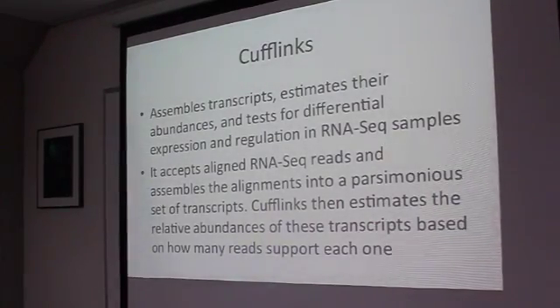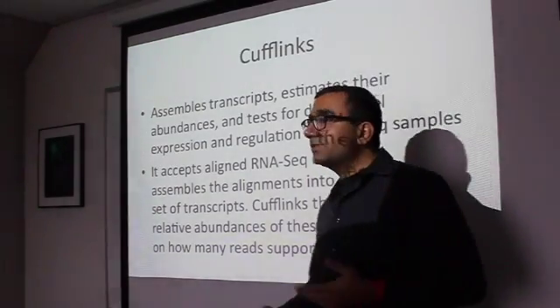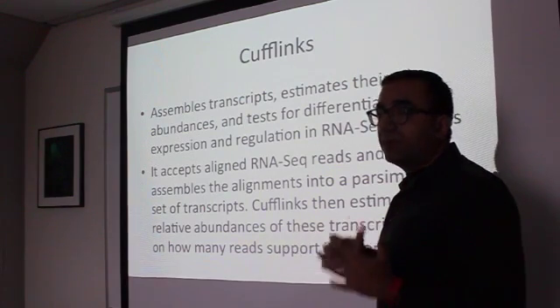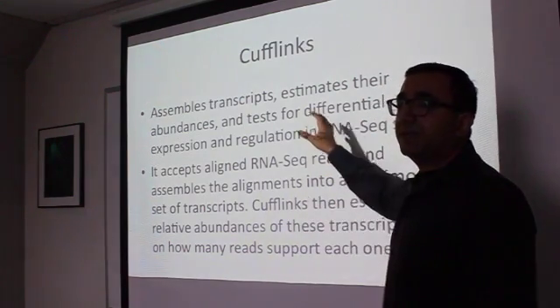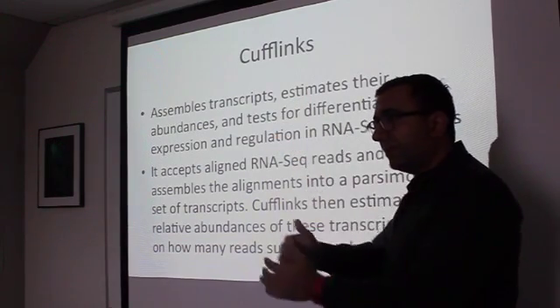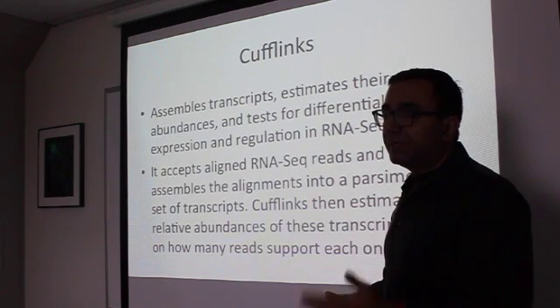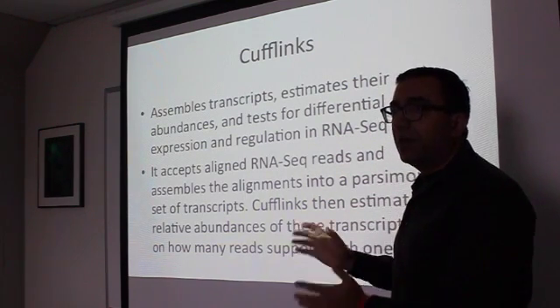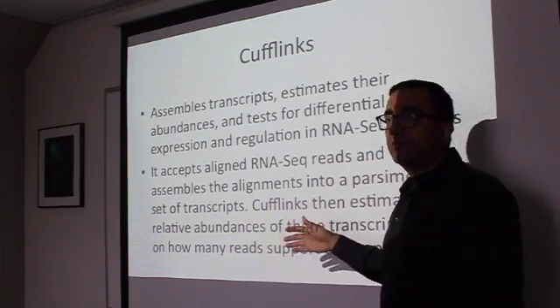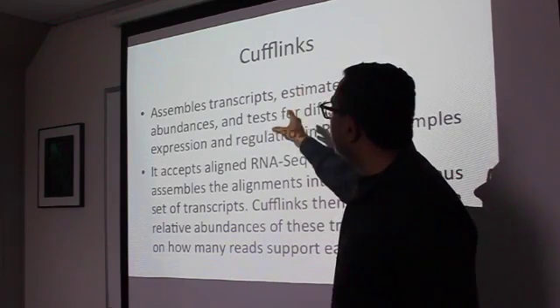I'm just mentioning this here because it is an option available as part of the Tophat suite. So normally, when I'm running my programs, I end up stopping at the accepted_hits.bam and then using that file via a separate process to create read counts, and then from those read counts do the differential expression in R, which we'll be covering in 2 lectures from now. But that option is available via this.